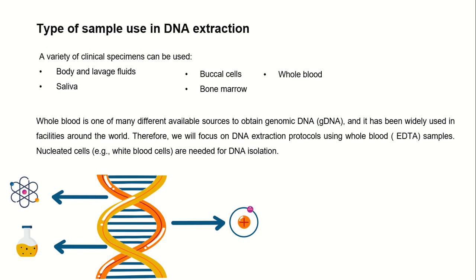EDTA is the anticoagulant of choice for blood collection for DNA extraction because it inhibits DNase activity and doesn't change the quantity of the DNA. Nucleated cells, the white blood cells, are needed for DNA extraction.